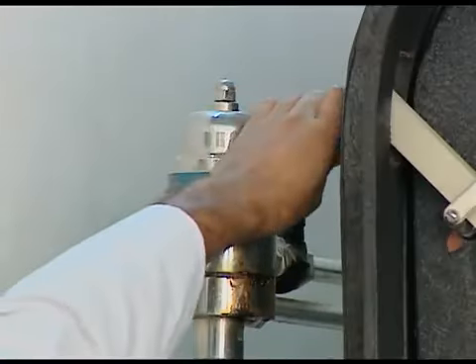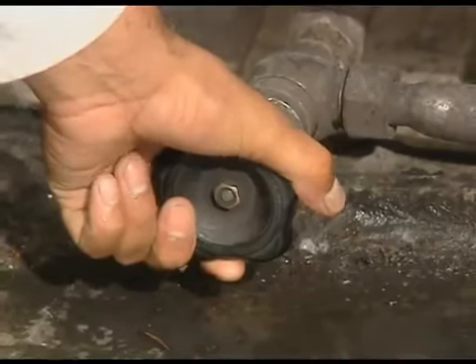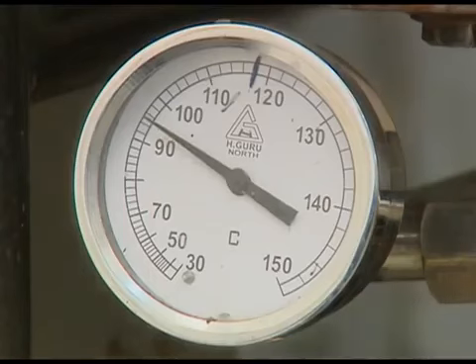These parameters are just right to sterilize the instruments and the media without degrading its composites such as sucrose, etc.